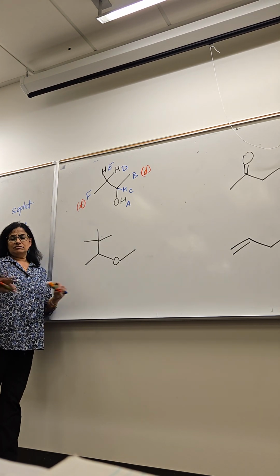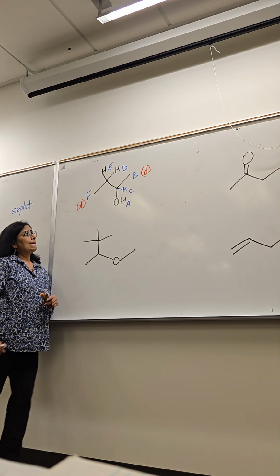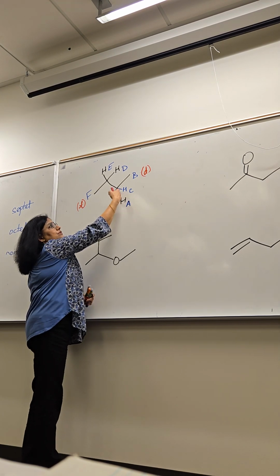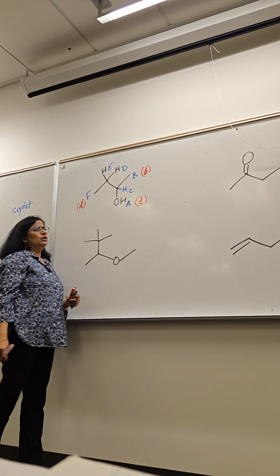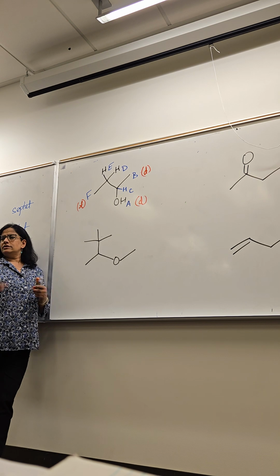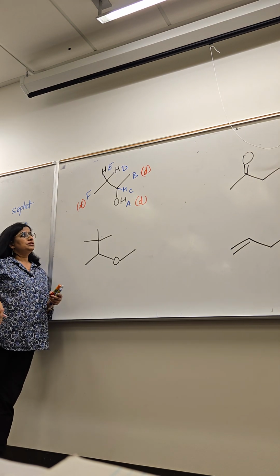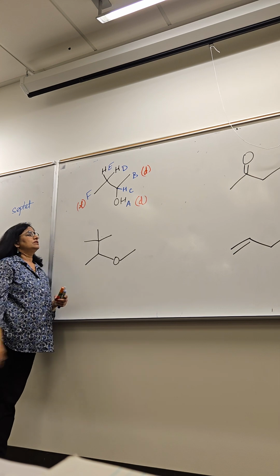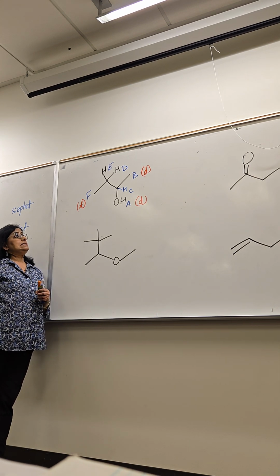I'm getting the relatively easier ones out of the way. What about A? Again, there's only one hydrogen on the atom next to it, so we expect to see a doublet, although with OHs generally, because of intermolecular hydrogen bonding, we lose multiplicity information, but at least that's our expectation for now. Are we good? Now let's talk about C.